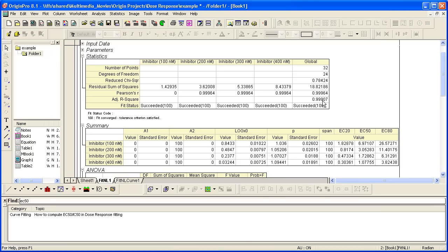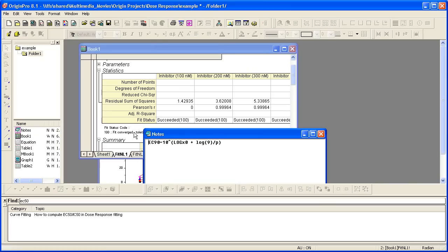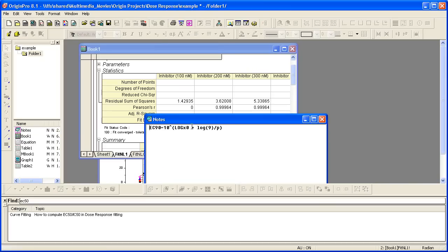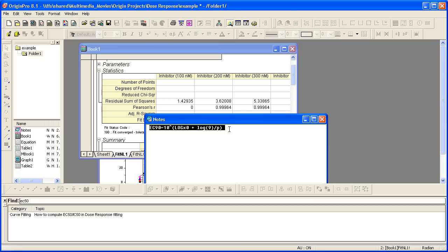Let's close this for now. And what we're going to do is go ahead and add EC90. So what I need to do, before I do anything, I can actually copy the value. I've copied the formula here, so I can just copy and paste to save myself some time.